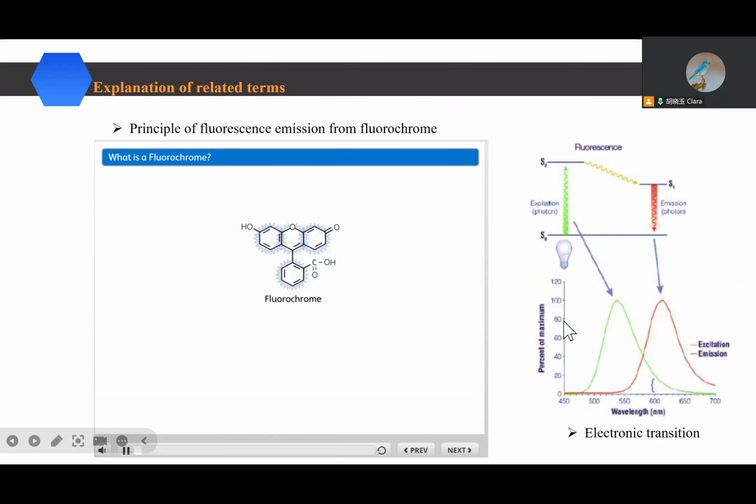And we learned that in the BF730, we have 3 lasers and 14 channels. So how can we get the information of the different channels? We use a reagent called a fluorochrome. So let's see how it is detected to get the information of the cell.